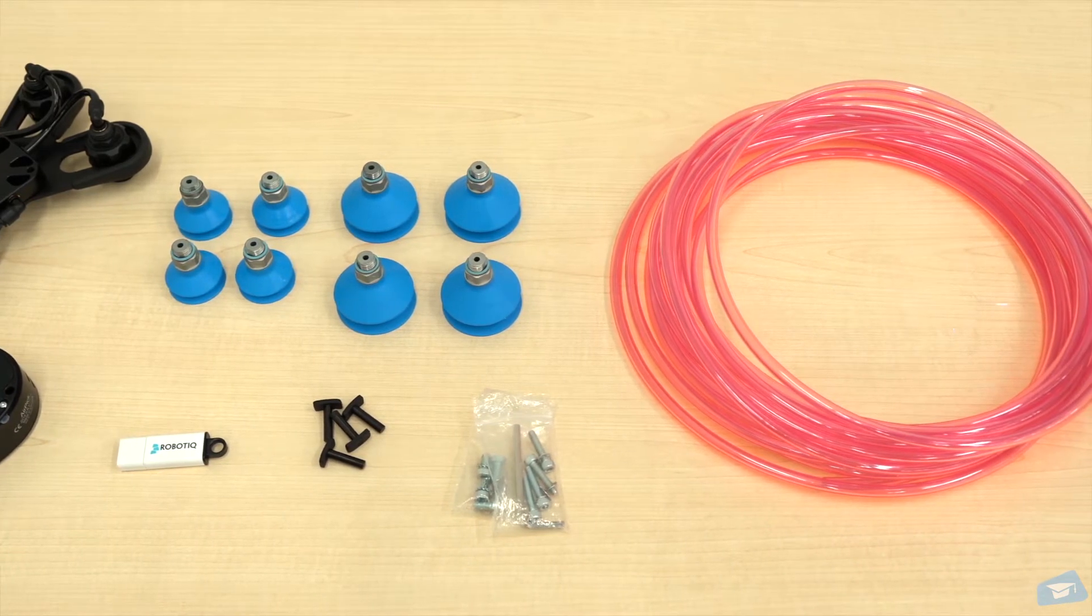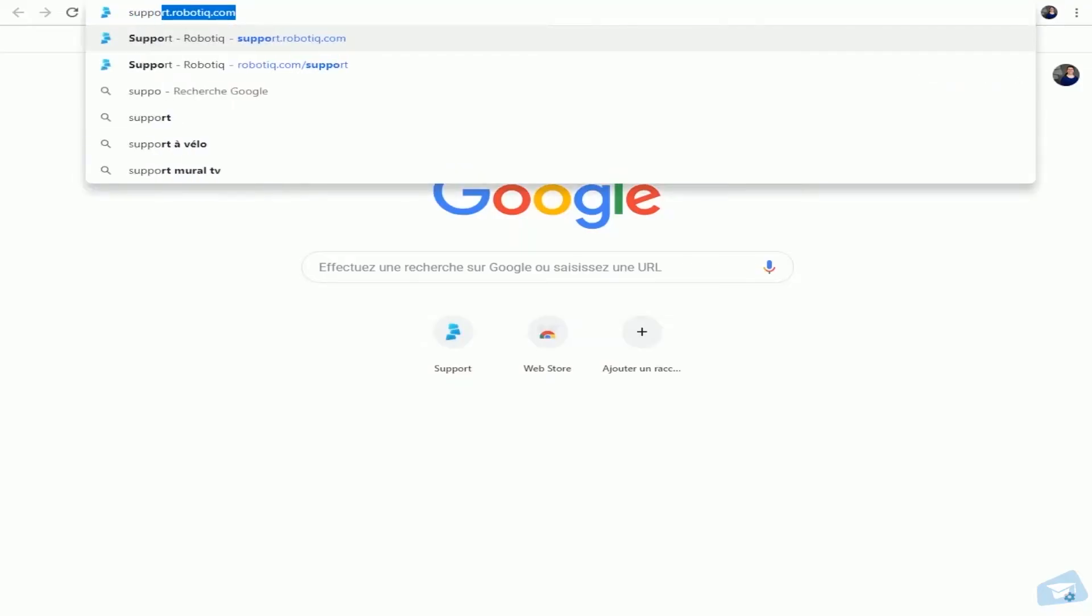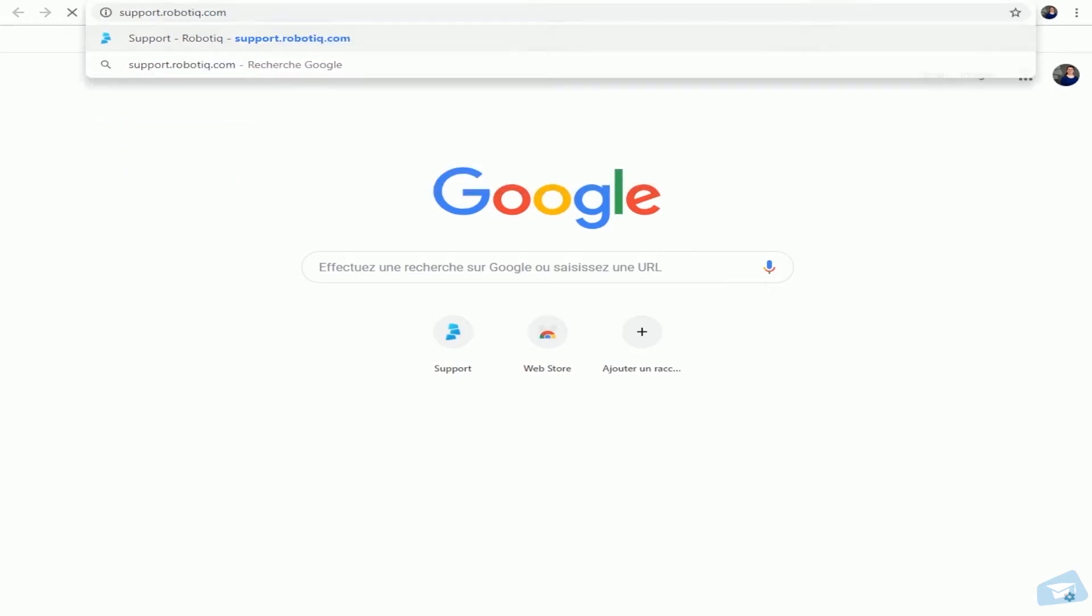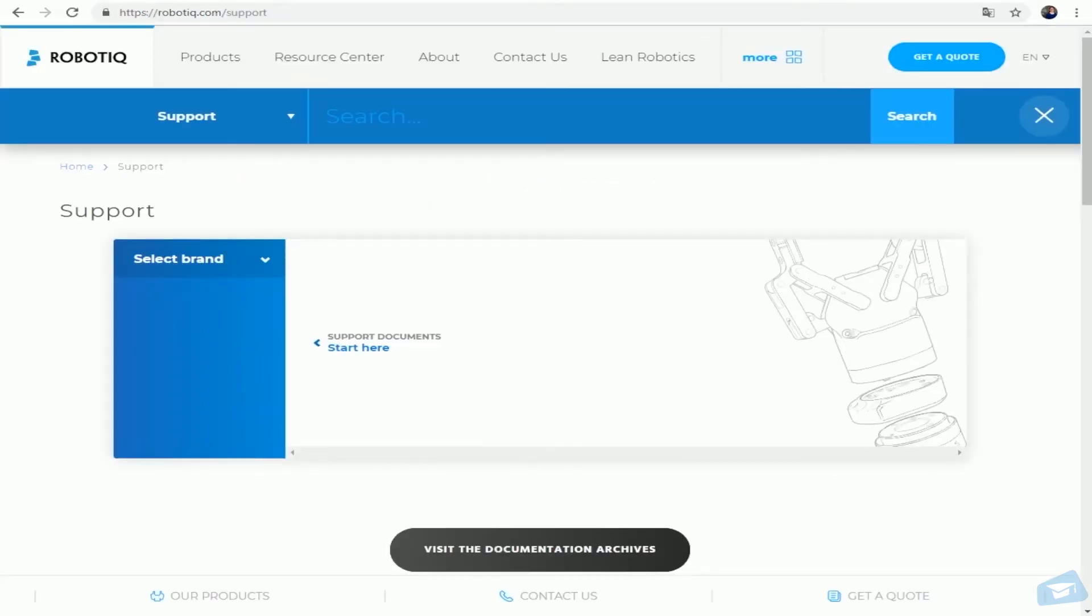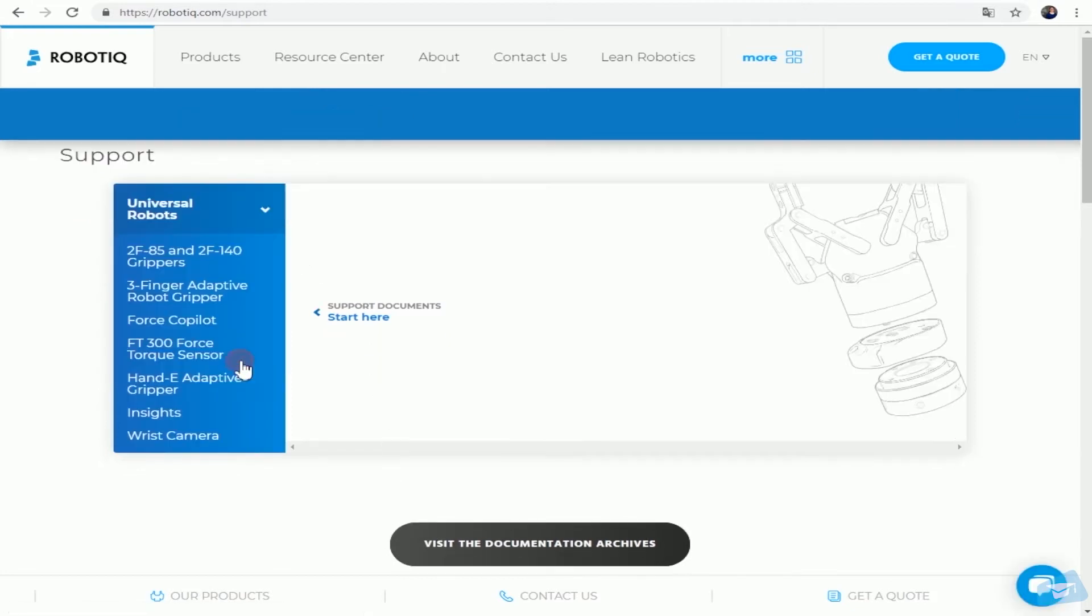In order to install your UR Cap, browse to support.robotiq.com. Select your robot brand, in our case Universal Robots in the drop-down menu.